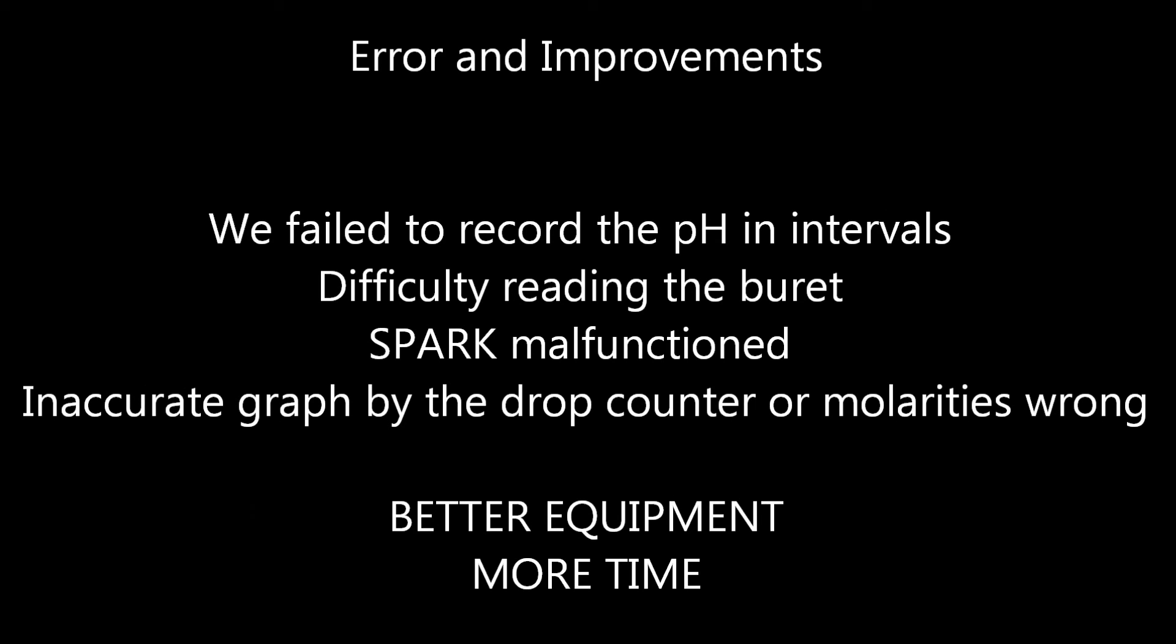Improvements and error analysis. We failed to record the pH in intervals at that point in time, since we assumed we'd have a graph from the SPARK. But our SPARK malfunctioned and accidentally led to our data being deleted. So we don't have the exact numbers, but we do have a graph that we took a picture of. In addition, our graph did not come out as accurate as we'd like it. Since we started out with 50 milliliters of 0.1 molar acetic acid, there should only be 50 milliliters of 0.1 molar NaOH needed to neutralize the reaction. So the equivalence should be at 50 milliliters. But the titration curve shows it around 32 milliliters. One thing we could have gotten wrong is that in the beginning we let out a stream of NaOH that may not have been picked up by the drop counter. Or it is possible that the molarities we were given were in actuality higher than usual, making the volume we needed less.